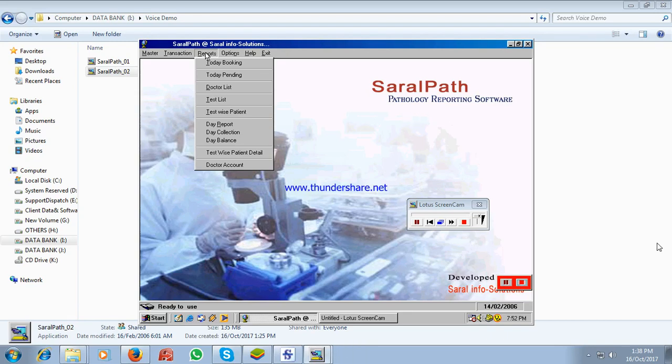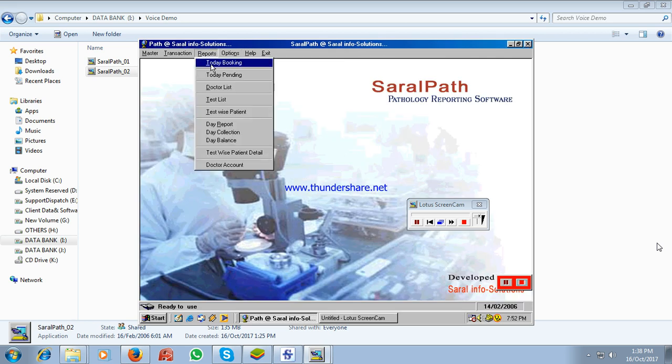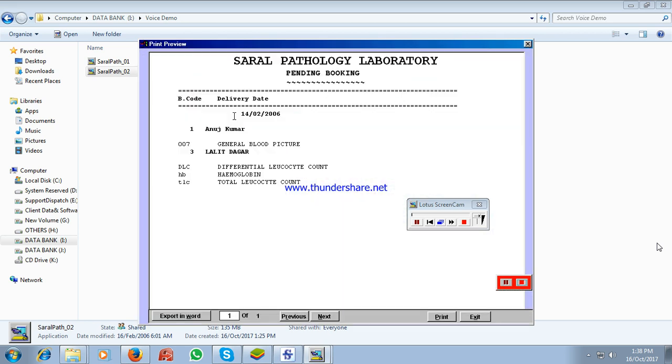In the reports menu, there are several sub-menus, the first being today's booking. In this, we see the list of bookings that have happened today. Today's pending shows the list of bookings that are still pending, maybe because the test was not complete.